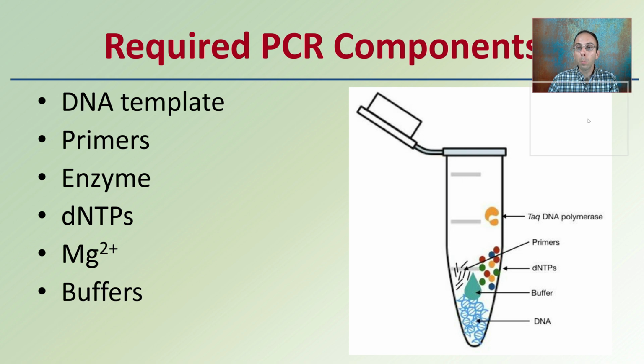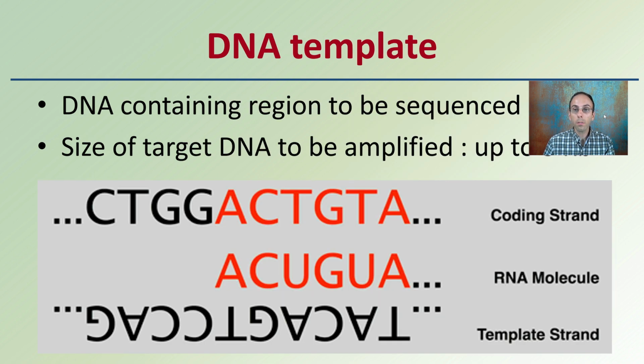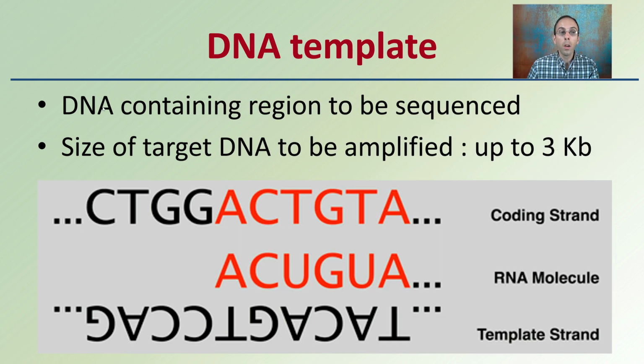Some of the required components for PCR are DNA template, primers, enzymes, dNTPs, magnesium, and some buffers. All these are mixed in that little tiny tube to allow the PCR process to go through its natural sequence. Starting with the DNA template, it's DNA containing a region to be sequenced. The size of target DNA that can be amplified is up to 3 kilobases. So again, not the whole DNA, we're looking at a section of the template.